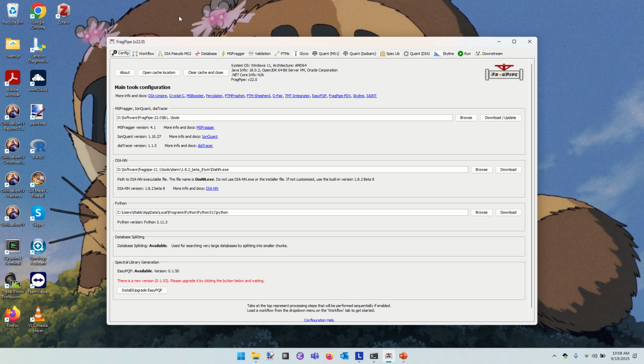And those are, first, identification, second, filtering and assembly, and thirdly, quantitation. The identification is the process of figuring out which peptide corresponds to a particular MS-MS. That's handled by the software MSFragger. The second phase of that is figuring out which spectra have been successfully identified and which unsuccessfully. So that's the process of filtering. It's also going to use a variety of methods to figure out which proteins these peptides belong to. That's protein assembly or protein inference.